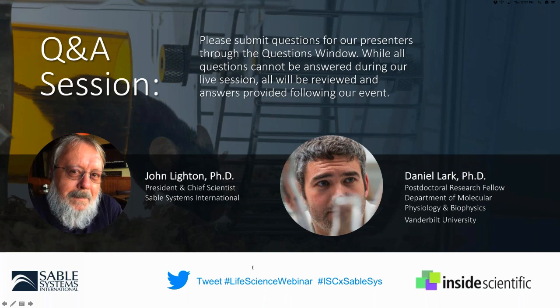Excellent. Javier has asked, is it possible to house several animals in a behavior measuring Promethion and use some type of RFID readers to detect activity from the different animals? You can certainly do that. Obviously, if you do the metabolic information, you will be getting the overall metabolic rate of all of the animals combined, so you can't really distinguish them. We are actively developing RFID at the moment, and we have a major RFID system which is going to be delivered fairly soon. There'll be more information on RFID and multiple animal housing and behavior information by the end of Q1 of next year, when we'll have a lot to show.